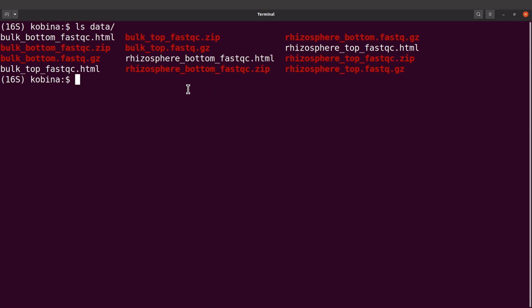If you have lots of files, if you run FastQC on lots of files, then it can be cumbersome trying to open the reports one by one. The reports can be found in the HTML files. It can be cumbersome trying to open them one by one using your browser and looking at the results. This is where MultiQC comes in. MultiQC can be used to aggregate FastQC reports.